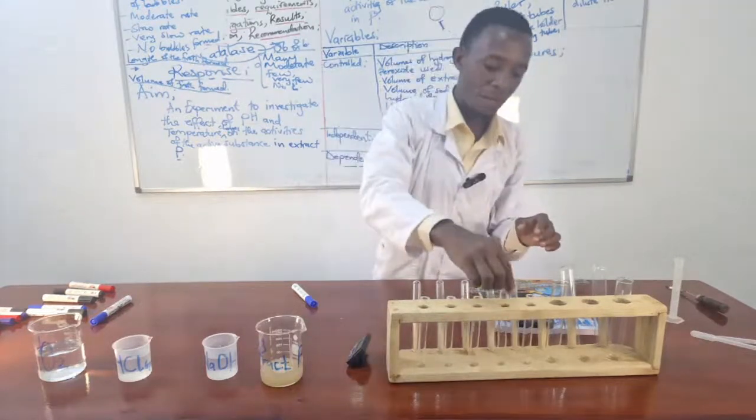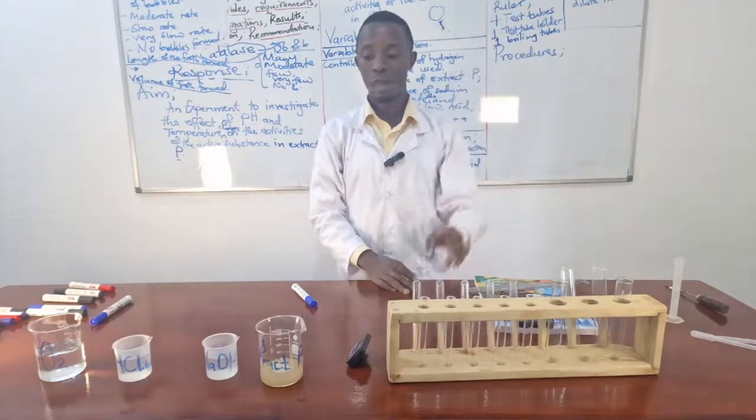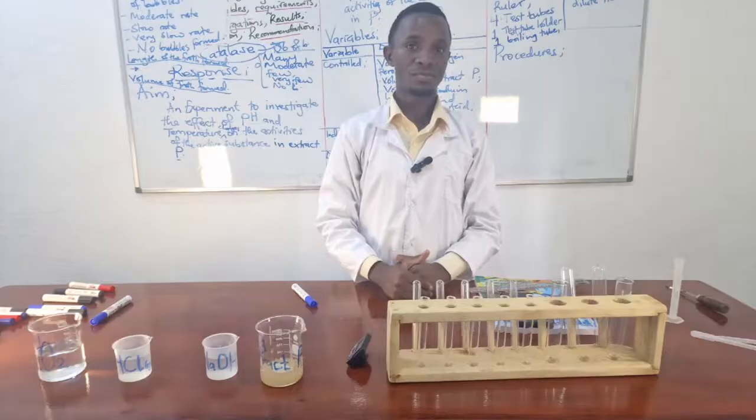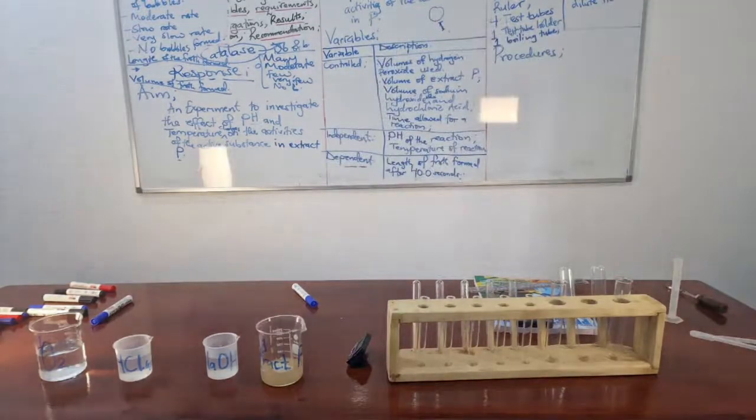So my first step is going to be boiling the extract such that I have 2 samples of extract P. Let me prepare my heat source here, boil briefly such that we move on with ease.